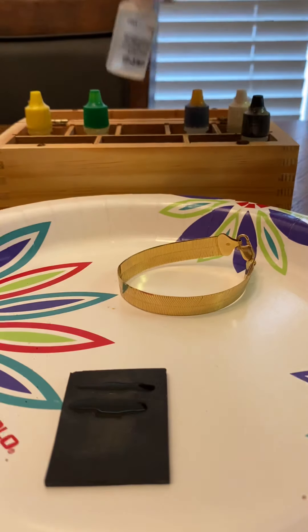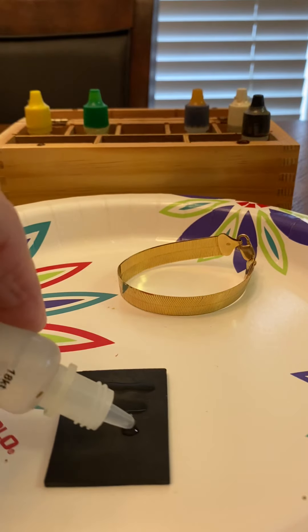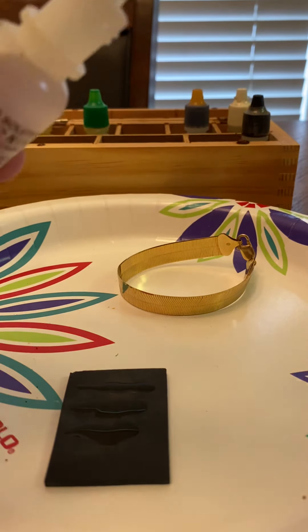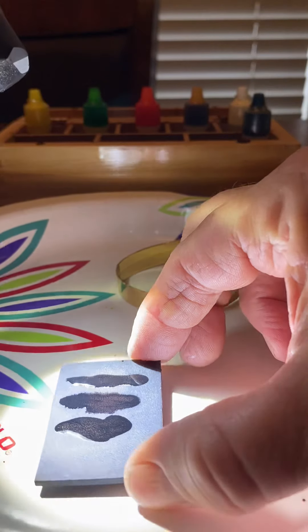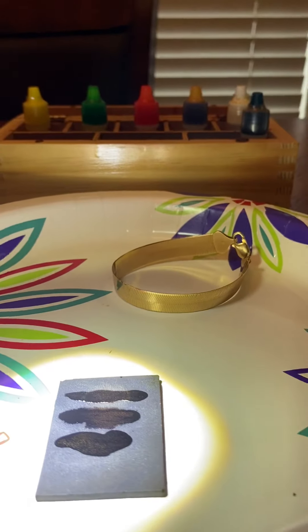I'm going to go ahead with the 18-carat acid. I expect it to dissolve right away because the bracelet is marked 10-carat, so I wouldn't think it would be 18-carat. And yes, the 18-carat is dissolving.